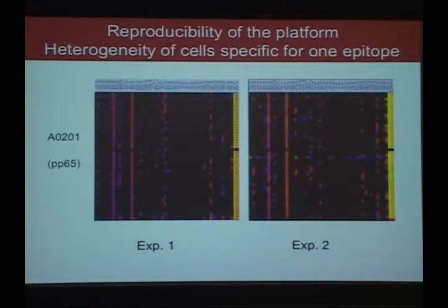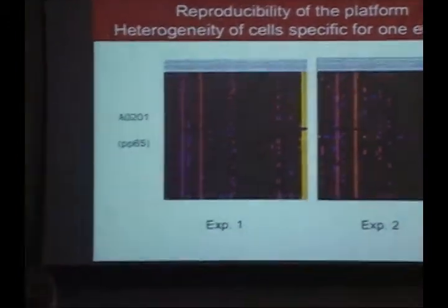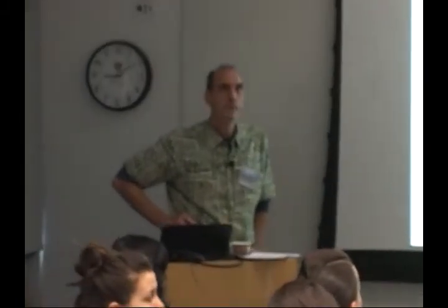Yeah. Joanna, yeah. So going back to the first step, when you do the sorting, I can see how that's advantageous if you're looking at a certain subpopulation that you're trying to analyze. But if you're looking at a heterogeneous population, can you just do cell counting and put it in that buffer? Sure, you could, but I think you'd want to do a single cell deposition, like with this C1 instrument that they have, something that assures you have one cell. If you do just a limiting dilution, you're going to get empty wells, 2-cell wells, 3-cell wells.